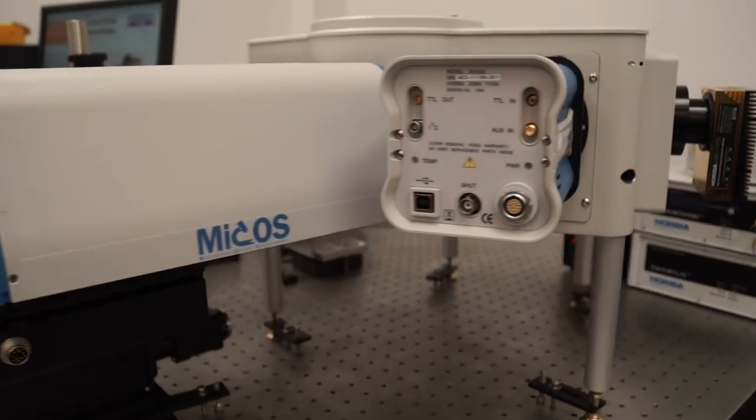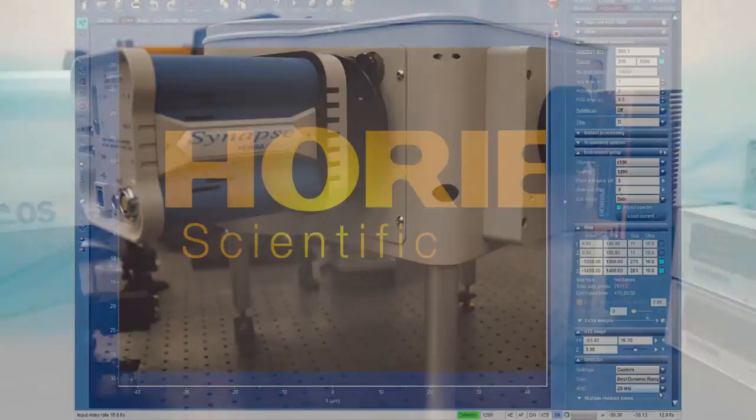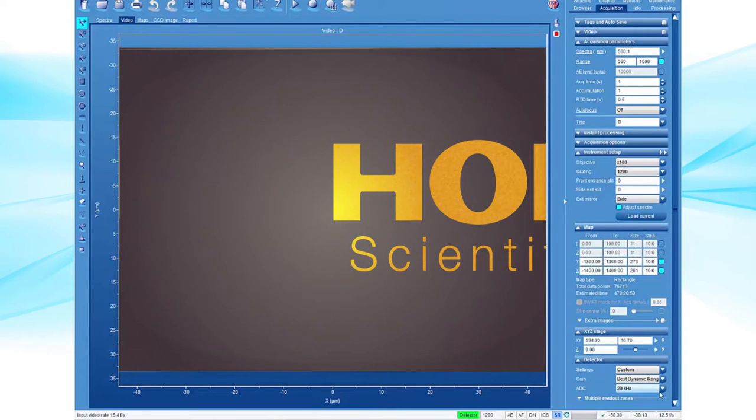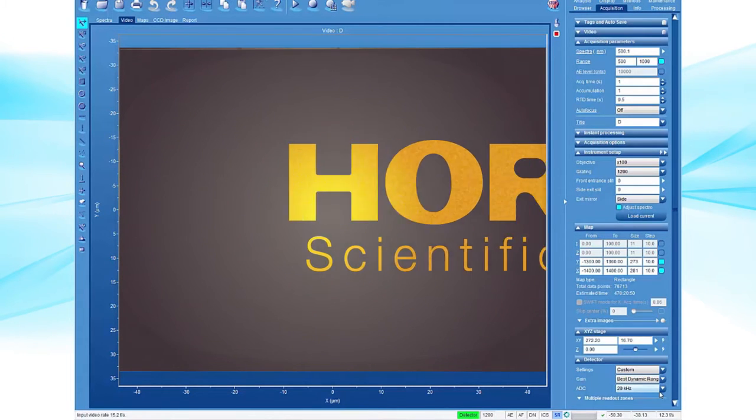A versatile and powerful dual-use system, the MICOS combines steady-state, time-resolved measurements on a complete, all-in-one photoluminescent spectroscopy solution.